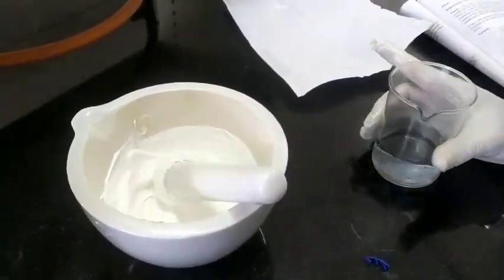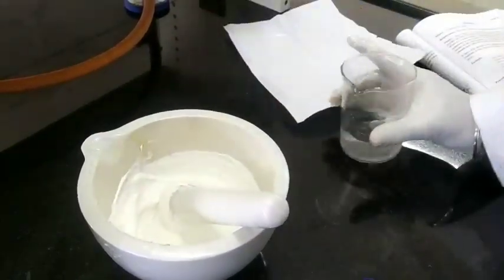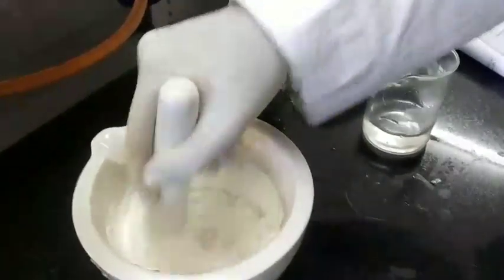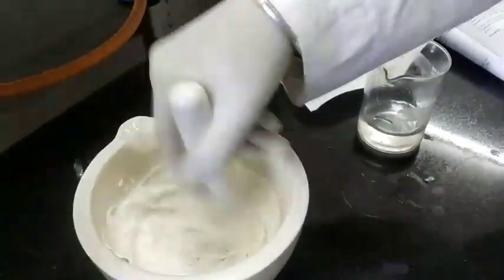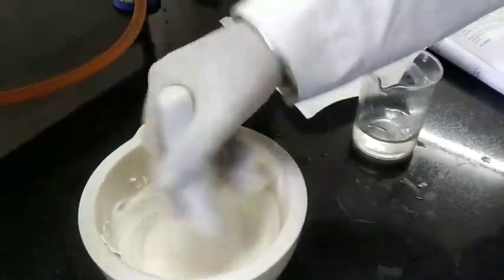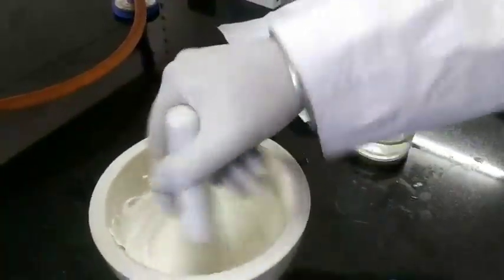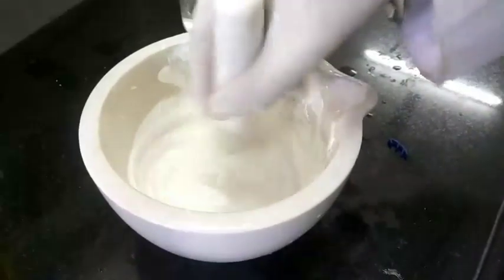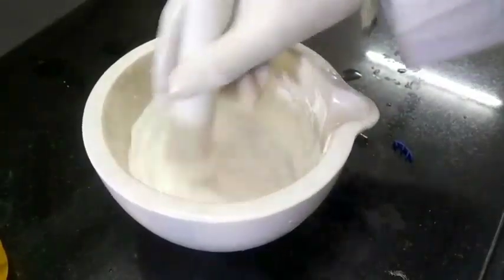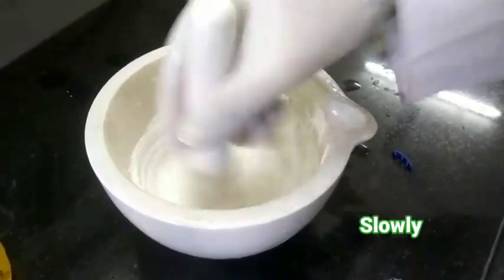Now add a small amount of liquid water with continuous stirring. Now we have added 20 ml of water to produce 100 grams.